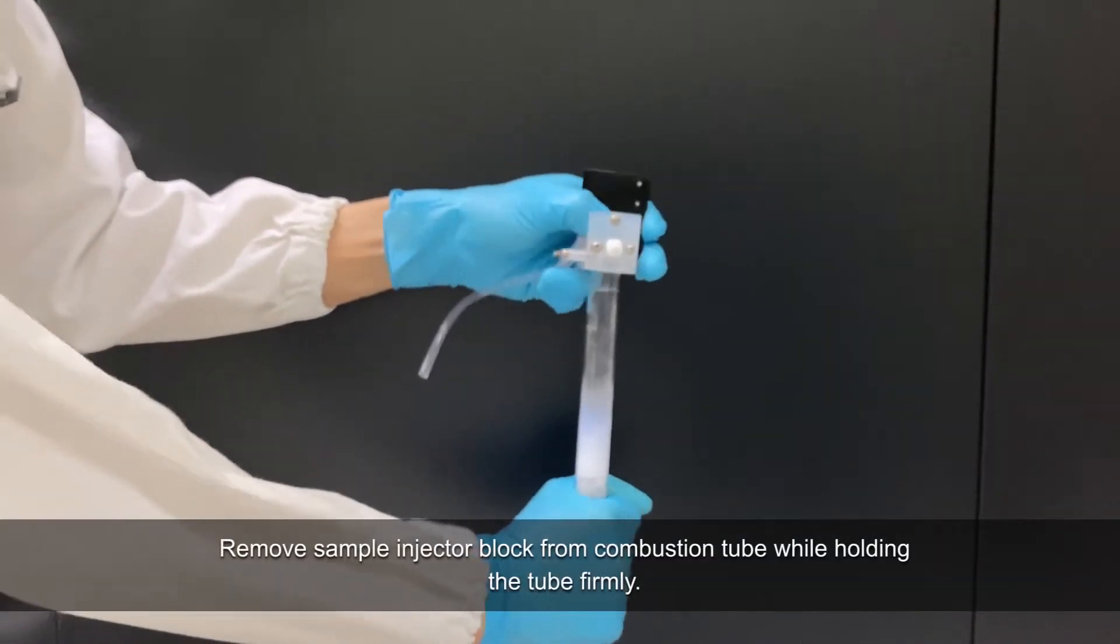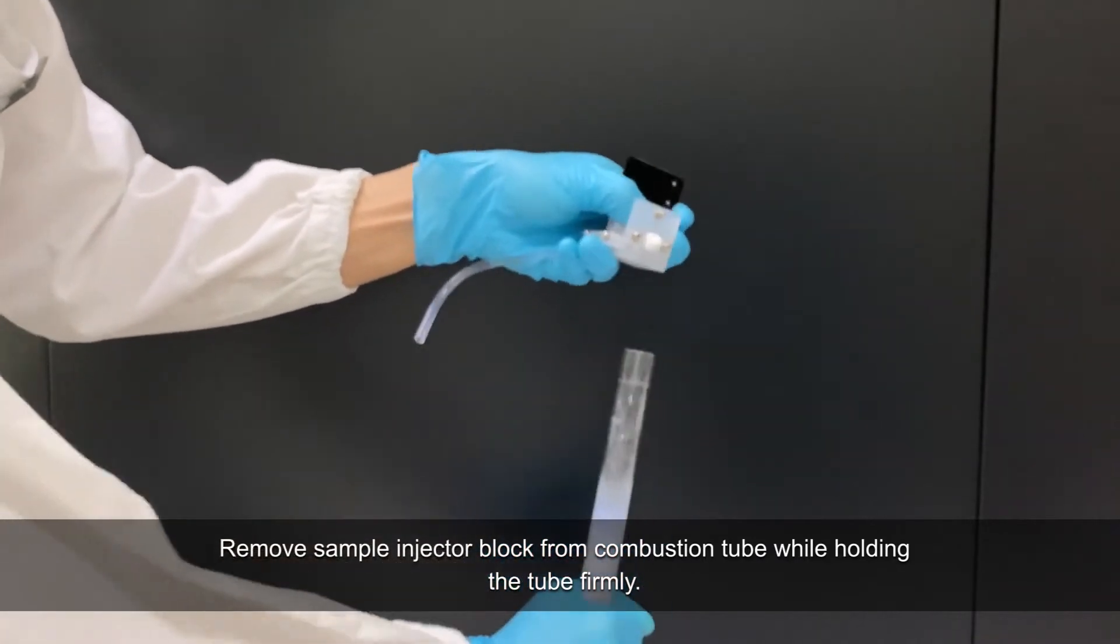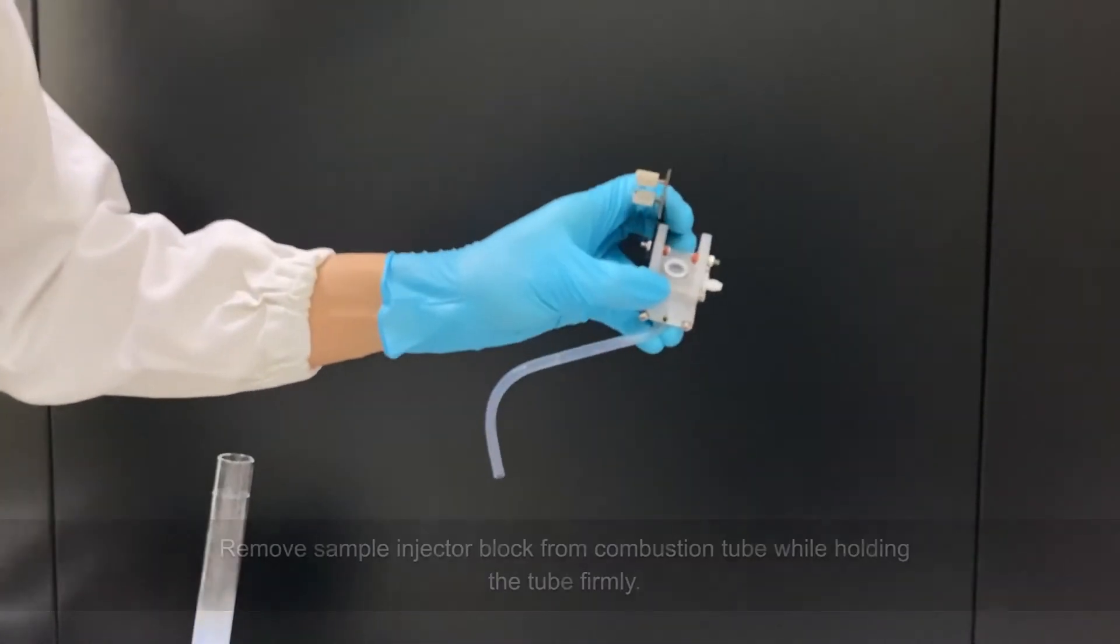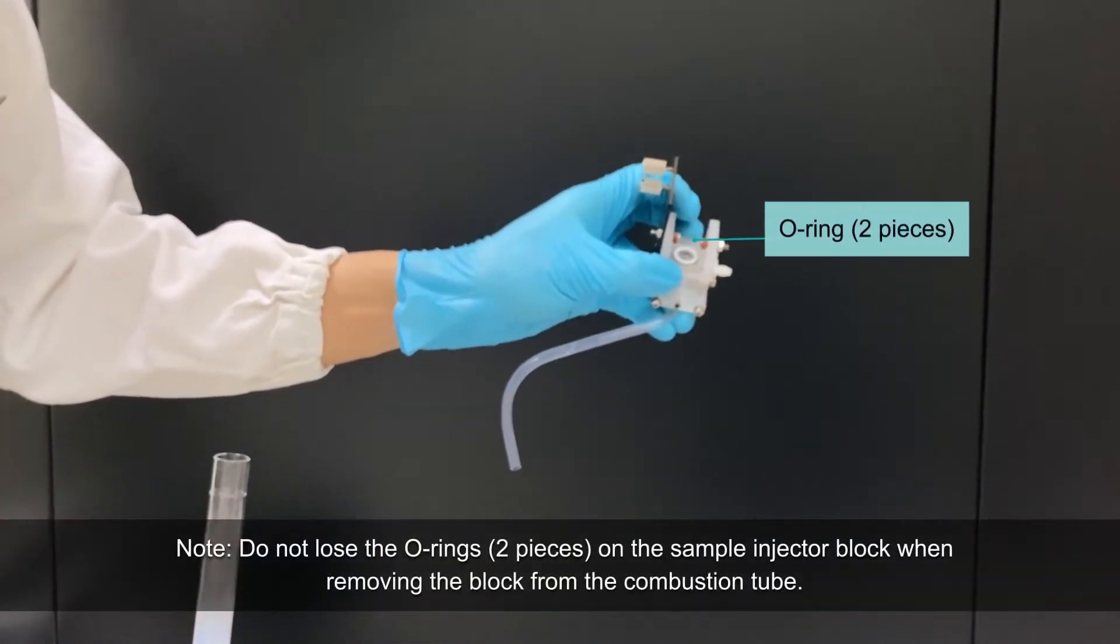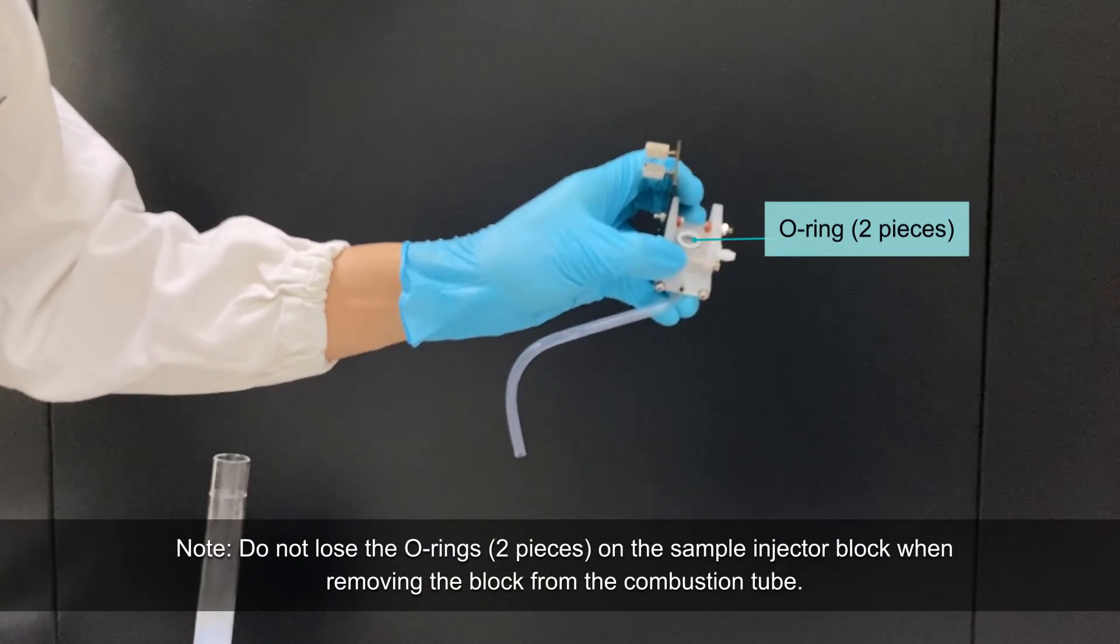Remove the sample injector block from the combustion tube while holding the tube firmly. Be careful not to lose the O-rings on the sample injector block when removing the block from the combustion tube.